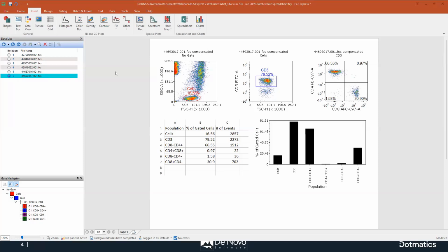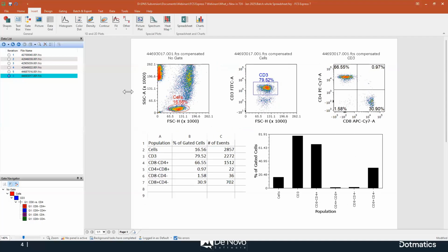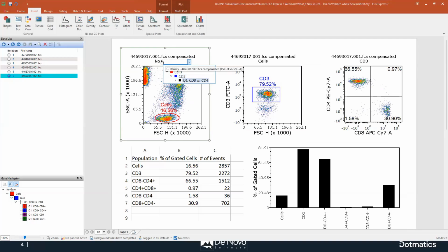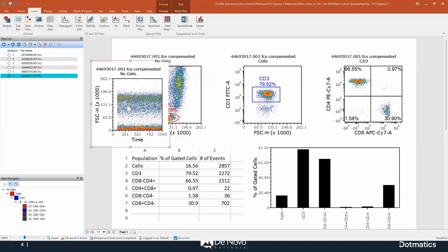I want to show you now that what we've done in terms of plots was not only changing the aesthetics, but now what you can do on a plot is change the gate applied to the plot by just clicking on the plot title. So in the past, let me, for example, open a new plot. Okay, this one. This is ungated.